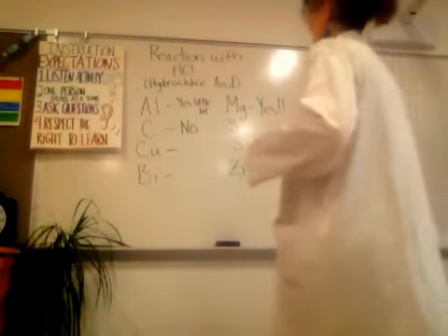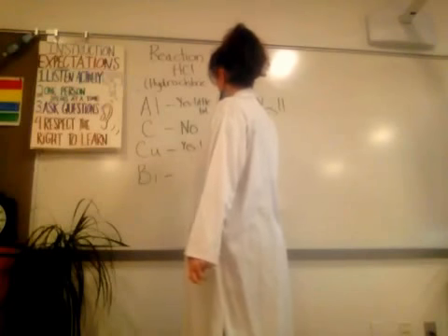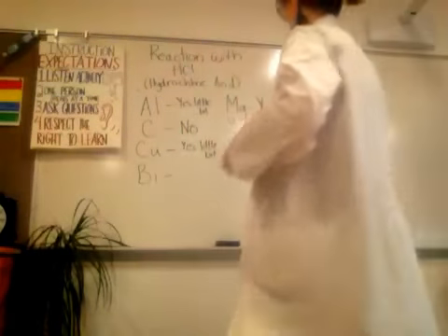Then we've got the copper. It's going to be acting very similar to zinc. It's very, very little bubbles, which are kind of difficult to see in this video. So we're also going to write yes, but a little bit. Bismuth, there's been no formation of bubbles, there's been no heat, nothing has happened, no color change. So that one is going to be a no.